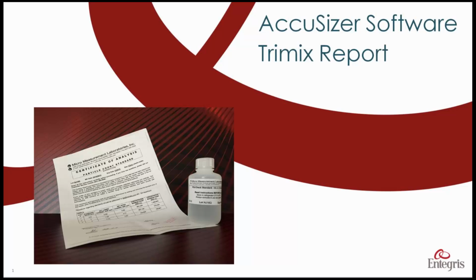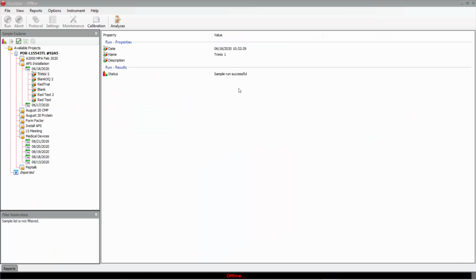This is AccuSizer software training on how to create the report when running the Trimix standard. If we want to create a report for the Trimix standard, the first thing we do is come into Analyses.